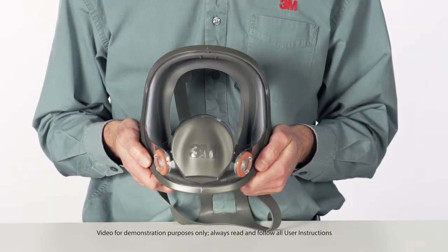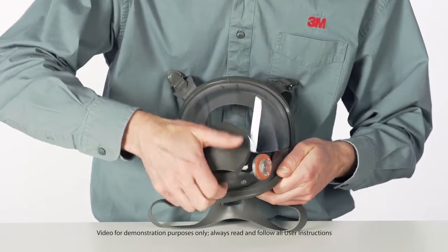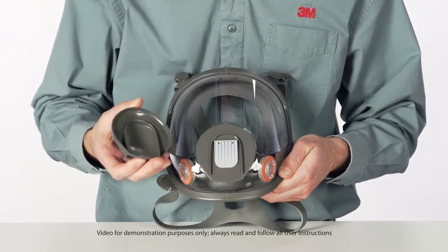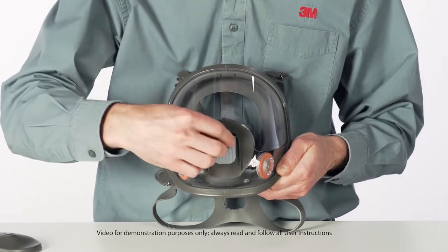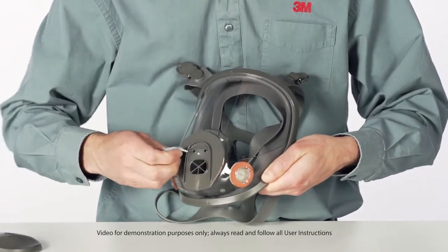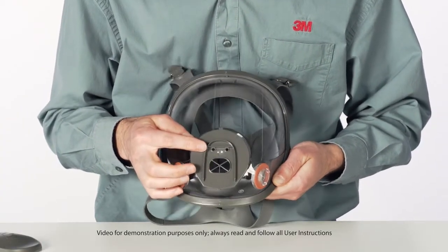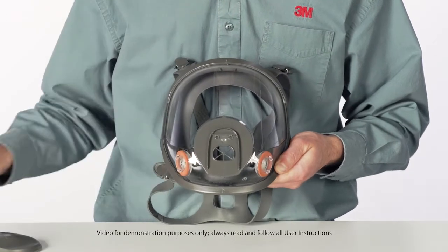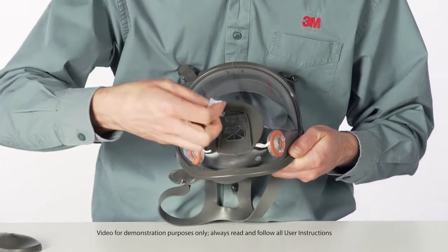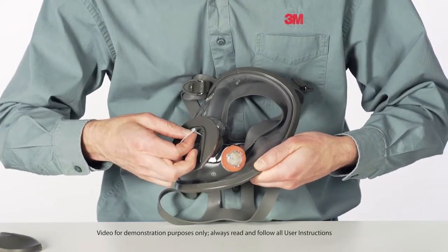Remove the center adapter cover by pulling it out from the bottom latch. Grasp the valve and pull each valve stem out from the valve seat. Inspect the valve seat, making certain it is clean and in good condition. Insert exhalation valve stems into the center adapter and pull through from the opposite side until they are both firmly in place.